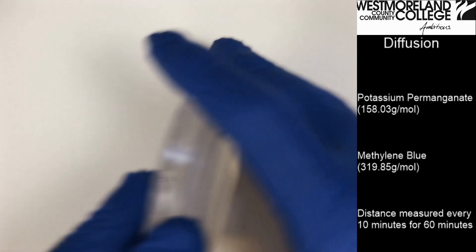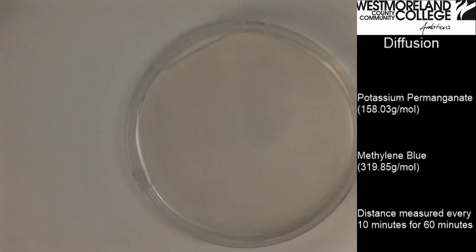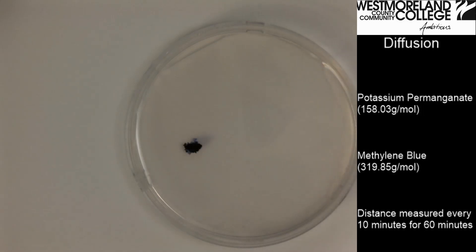I'll flip open my plate and add the solids — methylene blue and potassium permanganate. I tried to make them approximately the same size.